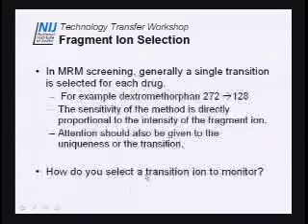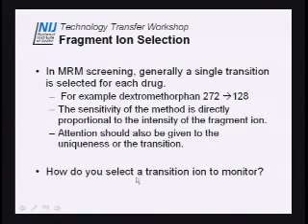All right. Back again. So the question is, how do you select a transition ion to monitor? One of the things you want to do is pay attention to the uniqueness of the transition.